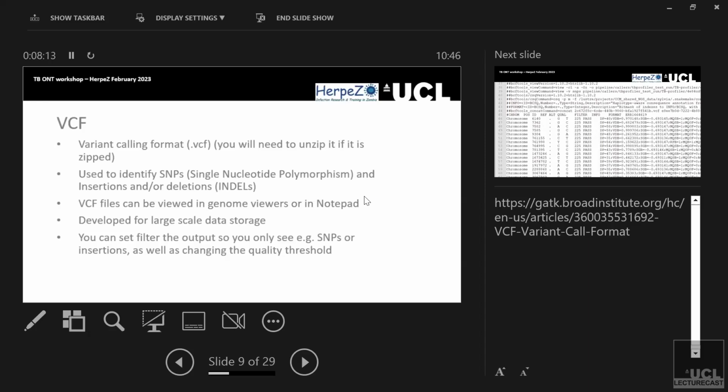There's a SNP there. It can do the whole genome, although that might take some time because that's quite a lot of information. Or you can specify, I want you to check in, say, rpoB. So you have to find the base numbers for rpoB, start to finish, and say, I want you to check specifically between base 23 and base 83, and it will check within those sections.